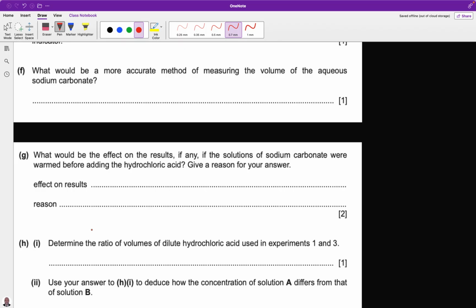From our previous video on measuring equipment in our experimental techniques, you saw that there were some apparatus that could be used for the measurement of accurate volume. Some could be used for rough or quick measurement.